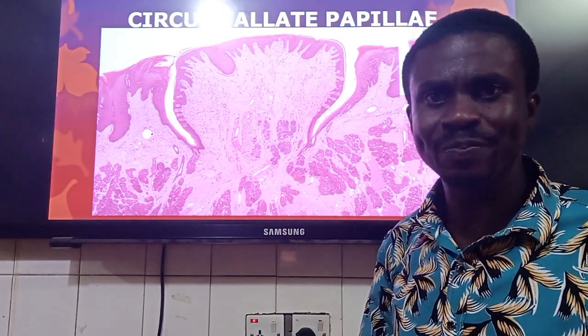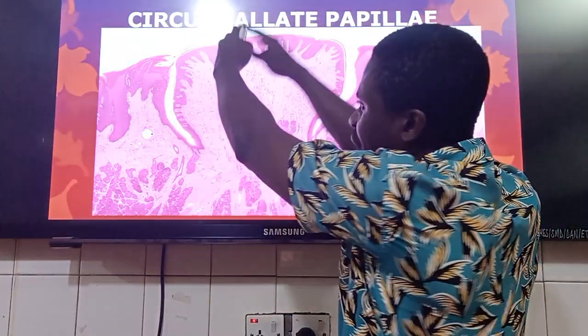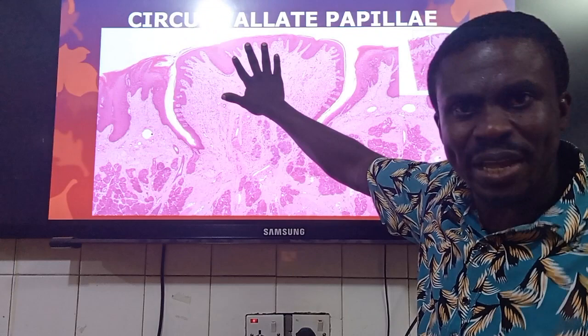They are going to be shallow. And so now, what's the reason why I said it should rather be called primary lingual papilla? The reason is that now there's a mucosal elevation made up of, of course, mainly the epithelial lining, and of course the lamina propria. Okay, that's what we see.